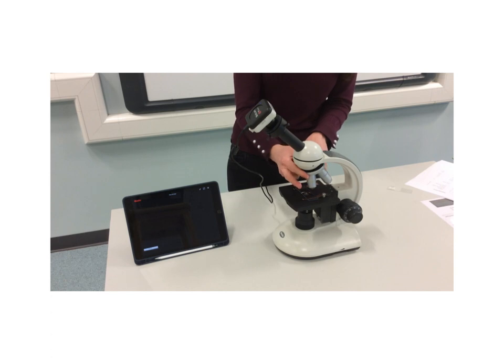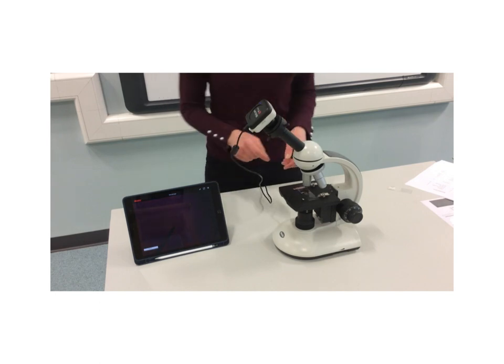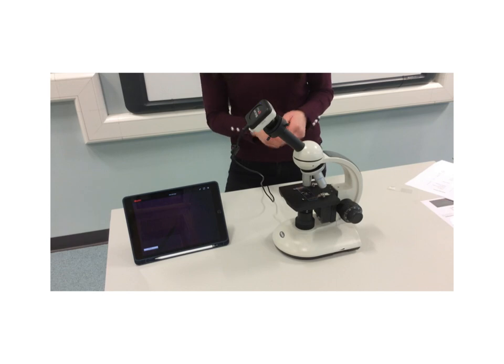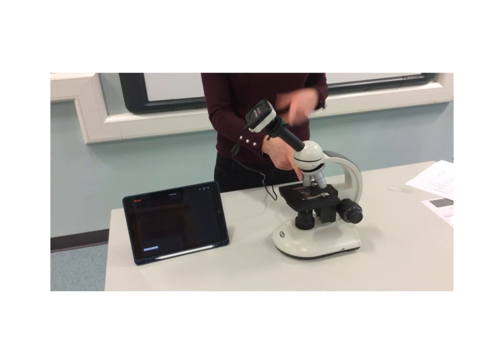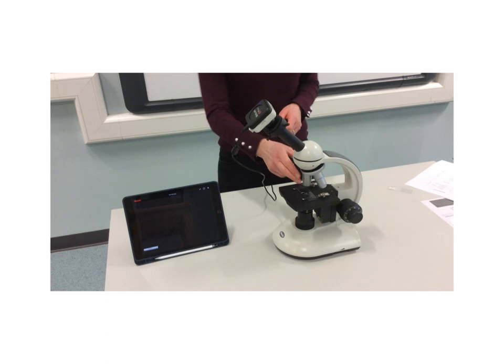If I turn the turret, so that's this little bit at the top, that's what I use to turn the objective lenses, I can put it onto the next magnification. So the medium power lens is times by 10, so it makes the image 10 times bigger. So that would be times by 10 times by 10 is multiplied by 100 in total. That will be the total magnification.